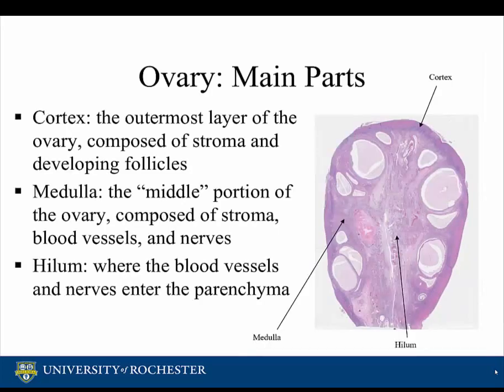The ovary has three main parts: the cortex, the medulla, and the hilum. The cortex is the outermost layer of the ovary, composed of stroma and developing follicles. The medulla is the middle portion of the ovary, composed of stroma, blood vessels, and nerves. This video will primarily discuss the cortex and the medulla. The hilum is where the blood vessels and nerves enter the parenchyma.